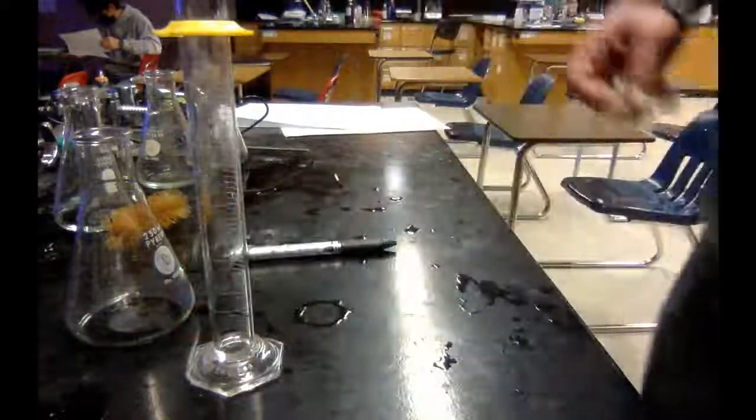So what size beaker should we get for that? The 250, right? There's reasons why the instructions say stuff, but I want to show you why that is. Does it say 100 for the HCl, or does it say 50? We know we only need 40, but it might say 100 because... It says 100 milliliters.